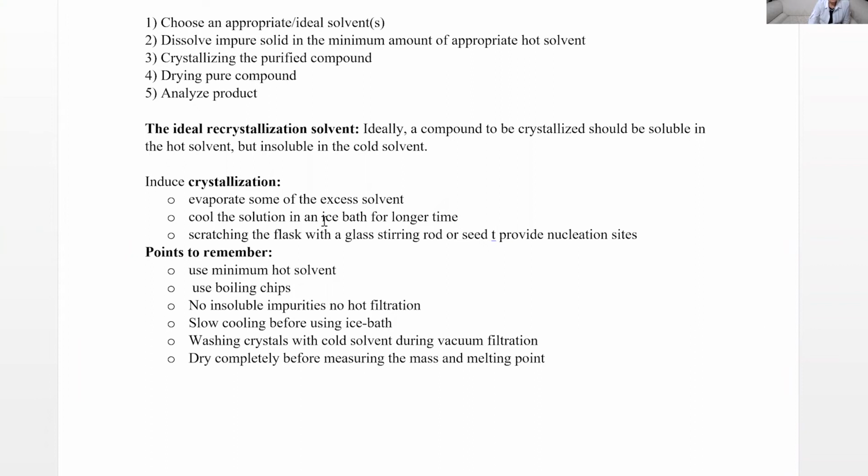If the solution is saturated, or if it's supersaturated, then to start the crystals, you are going to scratch the container, the glass container, using a stirring rod, or add a pure sample, like a few crystals of the pure sample, as seeding the crystals.